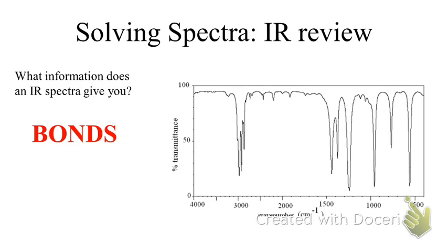Okay, not a whole lot of anything except we get a signal here, which happens to be a carbon to hydrogen bond where that carbon is sp3 hybridized. Okay, if you were in Gould's class, you probably had that whole section crossed out. So you would then ignore it. Is there anything in there that you should be immediately jumping on trying to solve from? No. Okay, which is one of the reasons why he crossed it out.